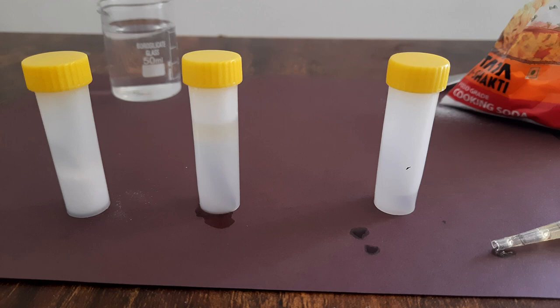At this point I want you to predict: which iron nail do you think will rust out of these three? We will leave this setup for around five or six days and come back to see which iron nail rusted.